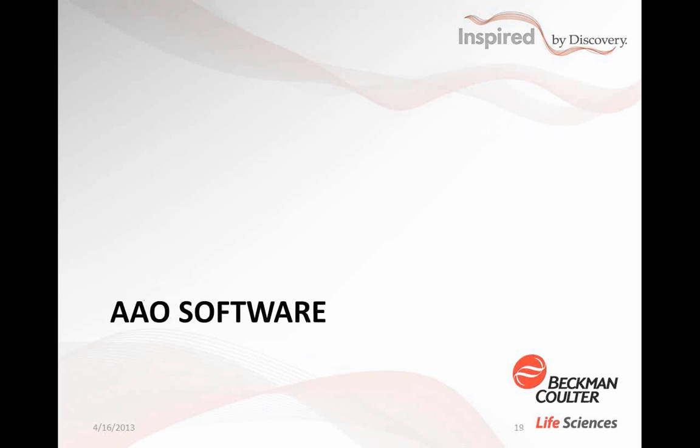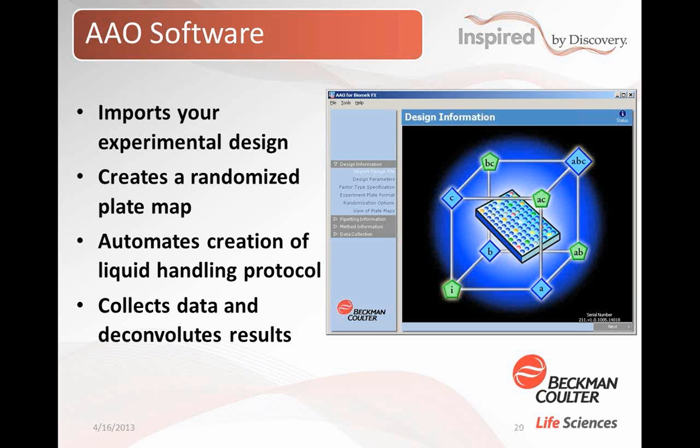So I wanted to talk about the software that we have. We ingeniously named it AAO after the Automated Assay Optimization. This is kind of the opening screen. Basically, this software is a bridge between the mathematics and the robotics.